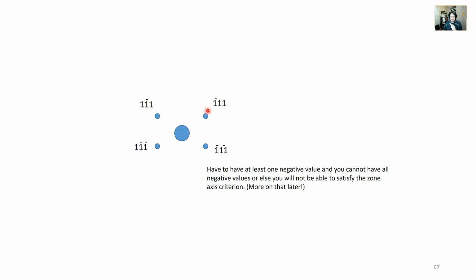And so I decided just to assign this one as negative 1, 1, 1. It's a little arbitrary, I know. I was going counterclockwise, and instead of having the first one be negative, I made the second one negative and then the third one positive, so I was only assigning one negative number. The rest of these spots are identified by symmetry. Again, this is a little arbitrary, and I don't want people to be confused, but I made these crosswise spots the opposite of these. So I arbitrarily picked negative 1, 1, 1 to be this first spot.